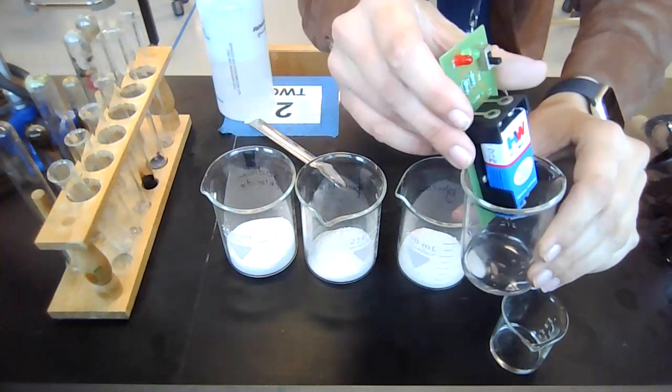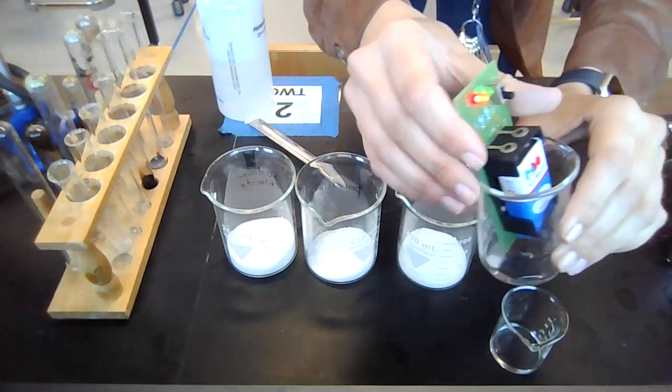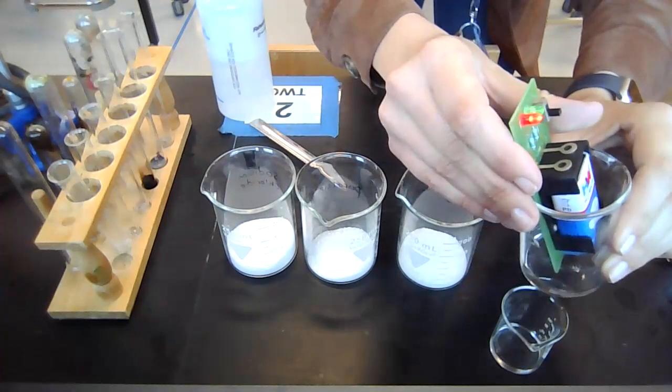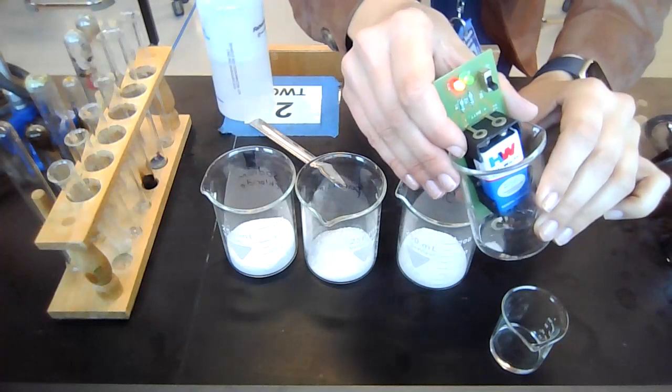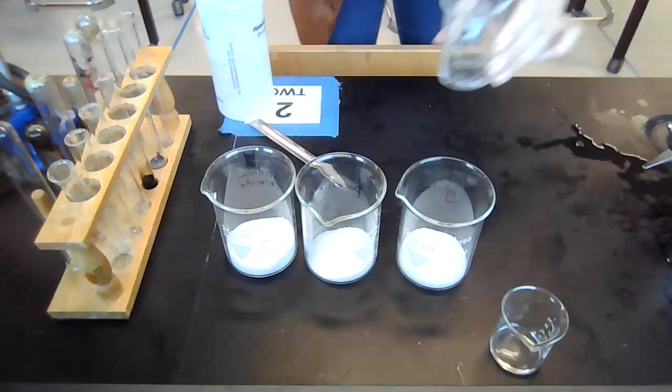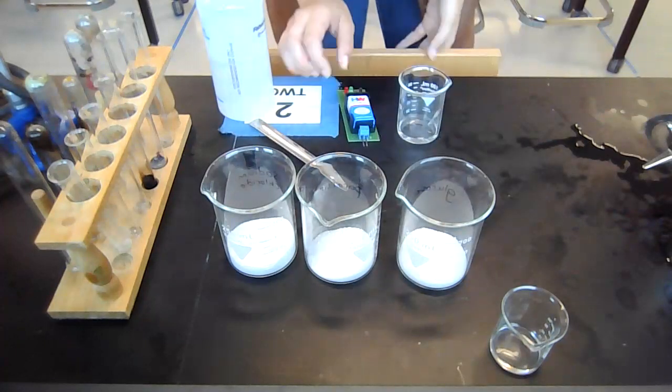So I'm going to put this into my salt water. I can see that both of those lights turn on, nice and bright. So when table salt is in water, it's very conductive. I'm going to go ahead and do the same things for my next ones.